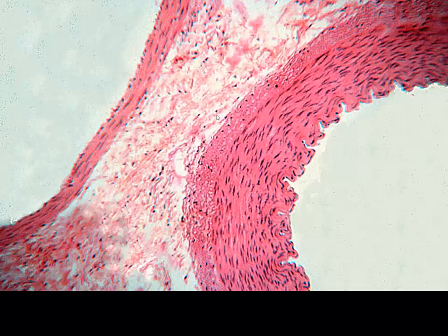Now once again, as we begin to look at a vessel, we're going to recognize the lumen of these vessels, and we have two here. We're going to recognize the tunica intima, which is the layer opposing the lumen. We have our endothelium. The middle layer is the tunica media, and then it's fairly easy to recognize the tunica adventitia. Now, within the media of this vessel, we can see a number of these circularly arranged nuclei. So this is going to be the smooth muscle layer. And this relatively thick muscle layer lets us know that this is a muscular artery.